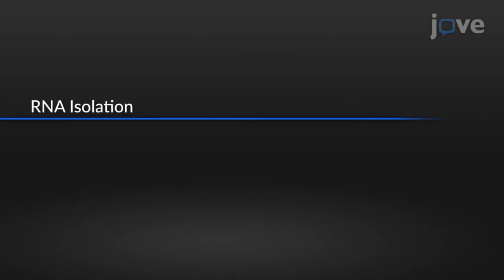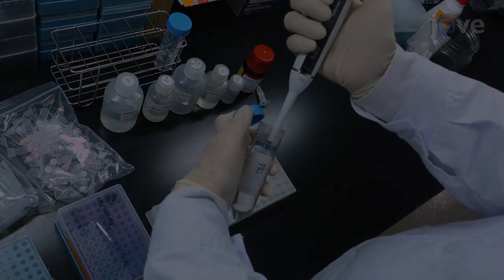For RNA isolation, after trypsin collection.